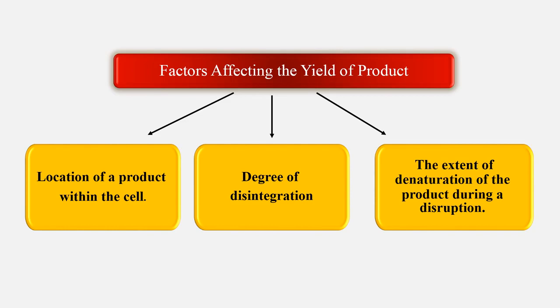While other molecules are strongly associated with others to form a complex or integrated with cellular membrane. بينما هنالك جزيئات أخرى ترتبط مع بعضها البعض لتكون معقدات أو ترتبط مع الأغشية الخلوية. لذا فإن عملية التحطيم الغير كفؤة قد تؤدي إلى تحرير جزء من هذه الجزيئات، بينما بقاء الجزء الآخر مرتبط مع الأغشية والعضيات الأخرى، فيكون المنتوج في هذه الحالة أقل.